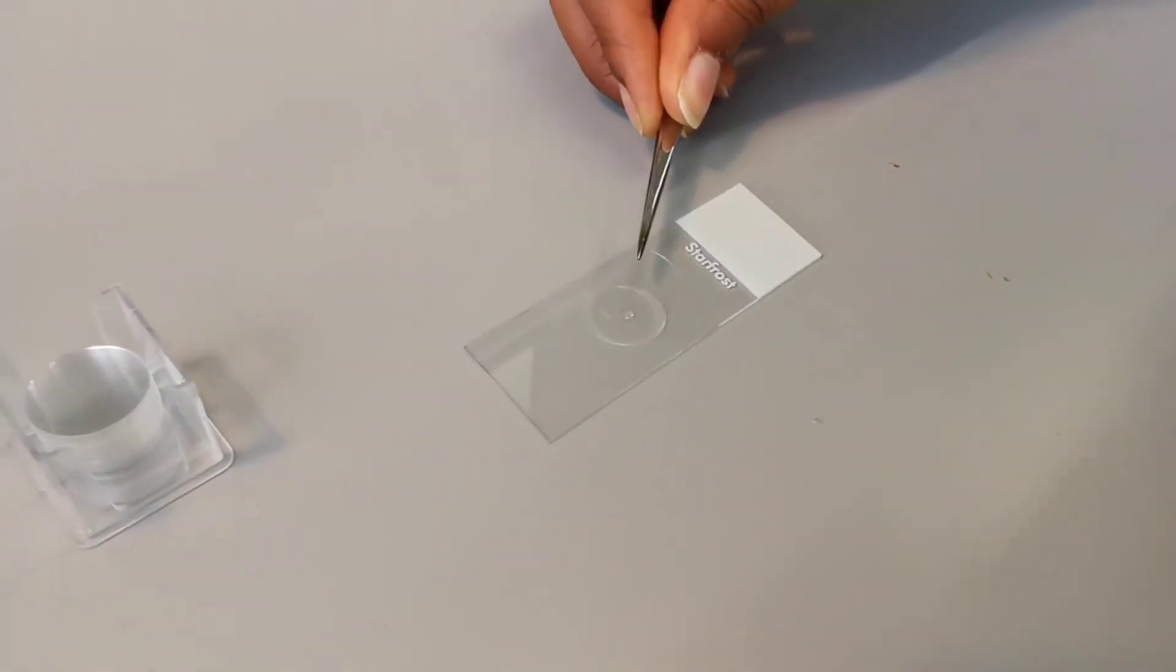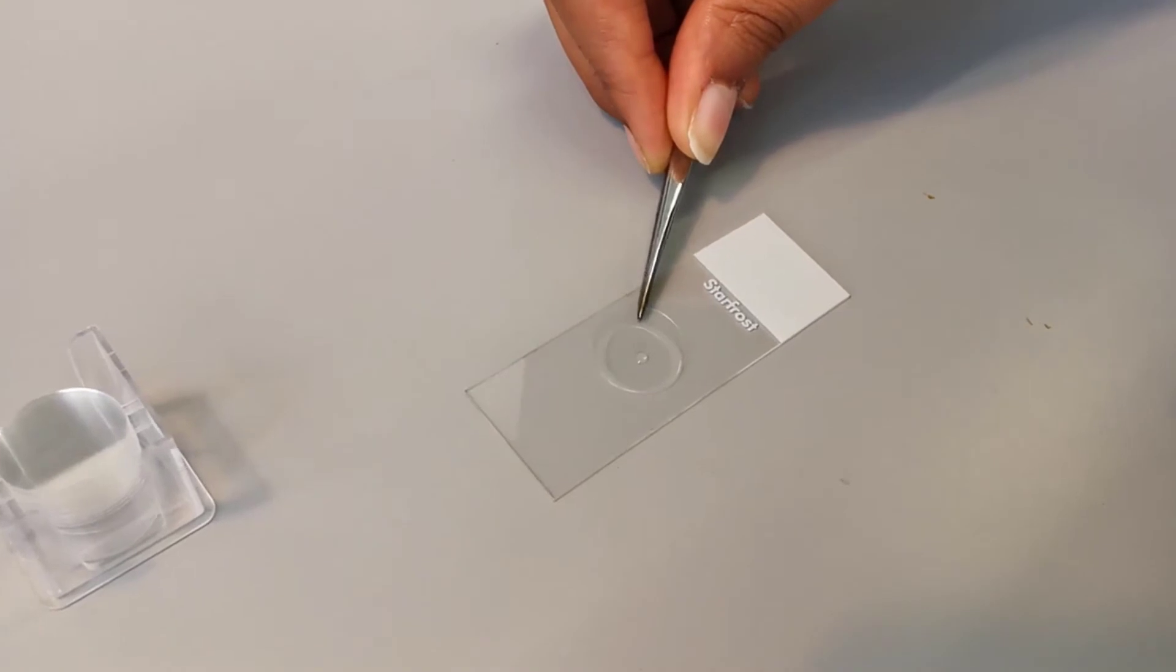Now, a glass coverslip is carefully placed on the ring of wax as shown.